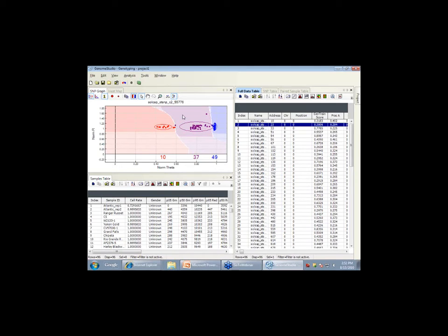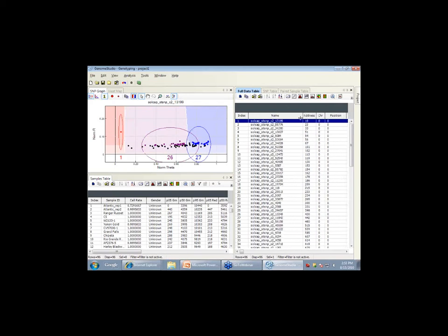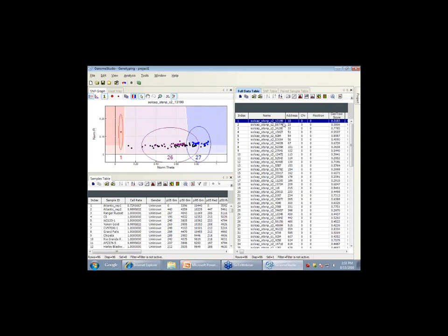And that's called your OPA file, which was one of the files already loaded on the computer. The OPA file defines what the SNP is and at what position. It basically has the criteria of what the sequence is, what the allele is. Is it a CG SNP, an AT SNP, and so on. And then the names of those SNPs. The names of the SNPs in this case are in the table over here. If I stretch this out, the name of the first SNP in the table is SolCAP C2 13199. So that data is captured in the OPA file.